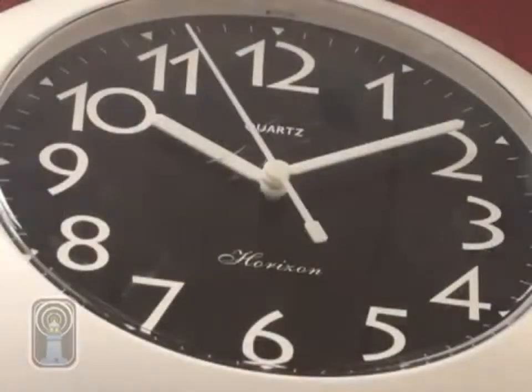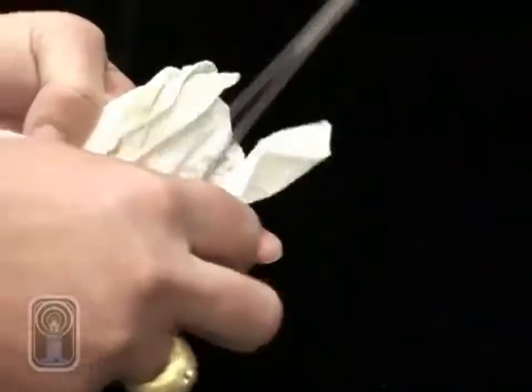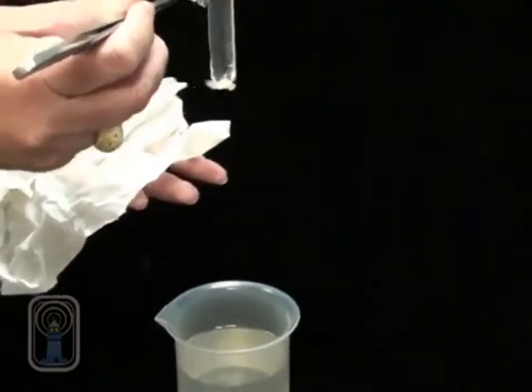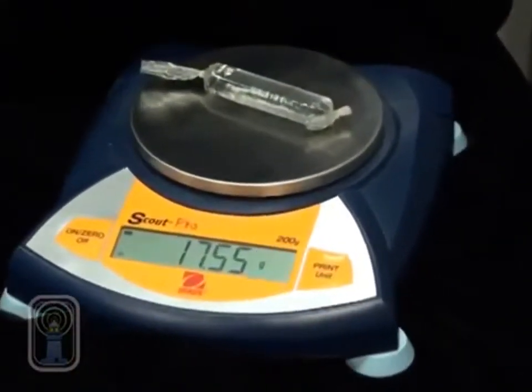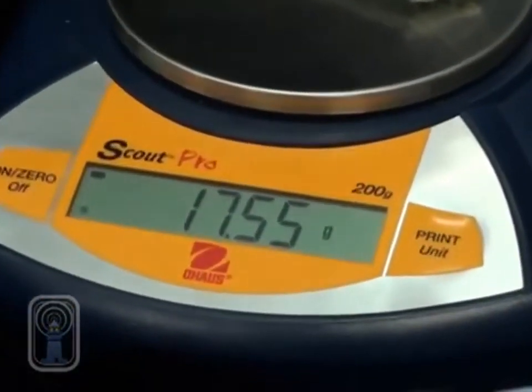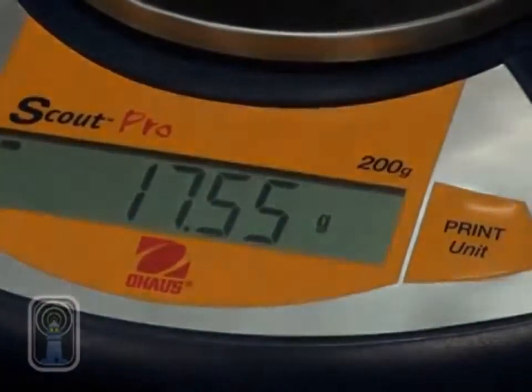After 30 minutes, the cell was removed from the beaker, gently patted dry, and again weighed on the digital balance. As you can see, there was a significant gain in weight from the water molecules entering the cell.